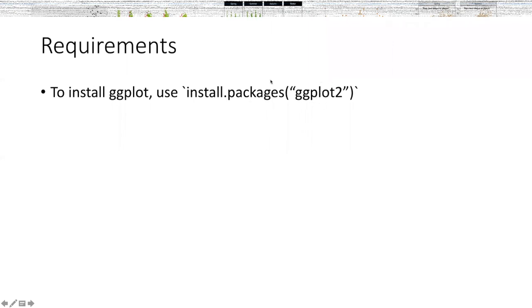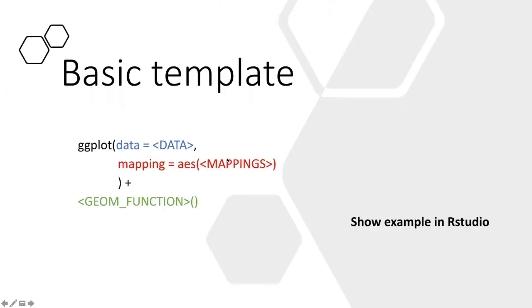So this is how you install the packages, all right? And then I want to talk about the basic template. So this is a basic structure, like the very basic structure. You absolutely need those core elements when you try to plot every single ggplot. So it starts with the ggplot function.